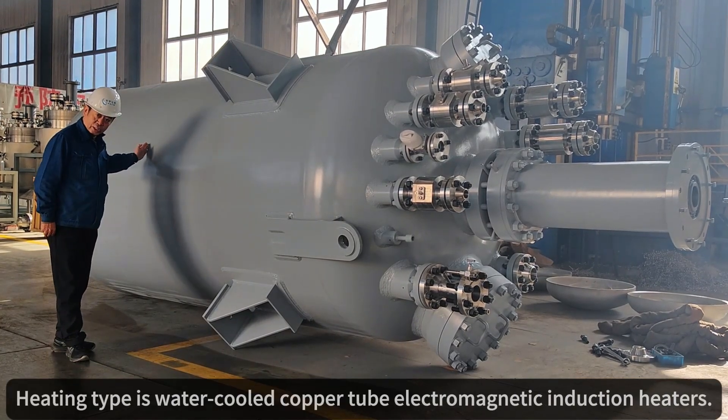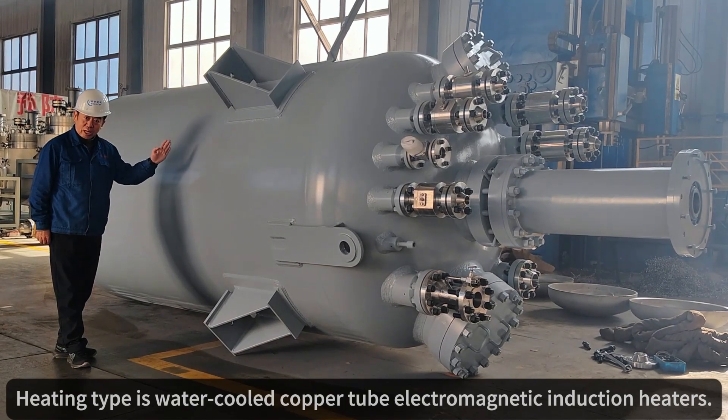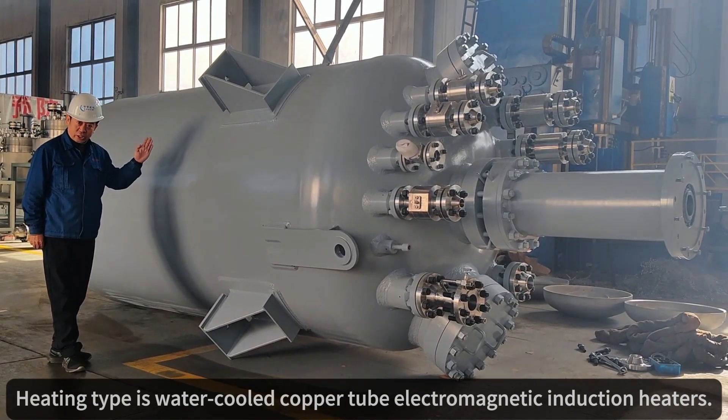Heating type is water-cooled copper tube with electromagnetic induction heaters.